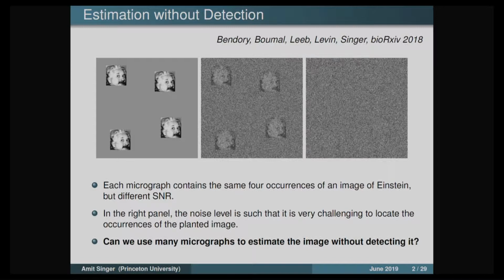That's very little, but what helps us to do it is that I computed a statistic, the average. And why did it work? Because it's independent of the actual locations. It's shift invariant, or translation invariant.